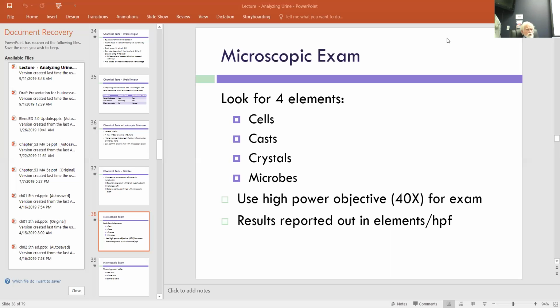The other day, Monday, when I was just testing the microscope and doing a quick round of microscopic analysis on a urine sample, there wasn't a whole lot of solid material in my urine. Very little, in fact. But there is almost always some, because we do excrete these things, they concentrate, and crystals form when they get concentrated. So we'll see what some of these things are. So we'll go on.